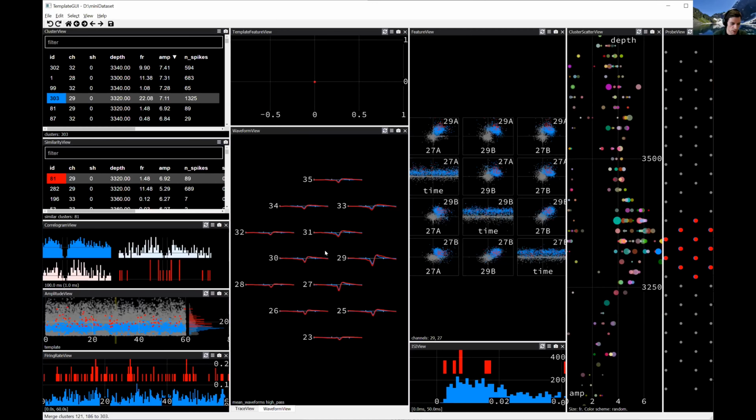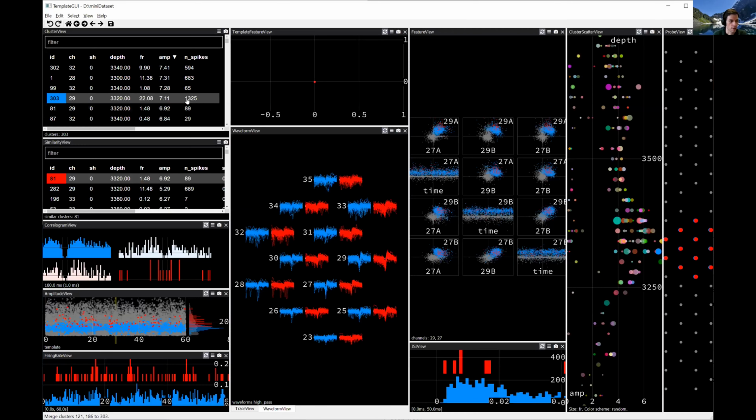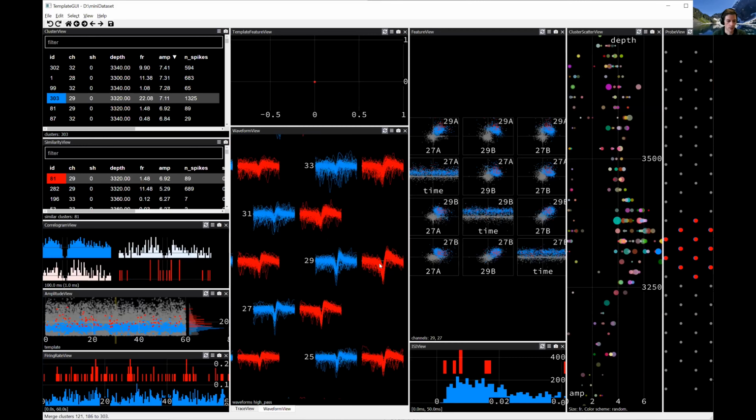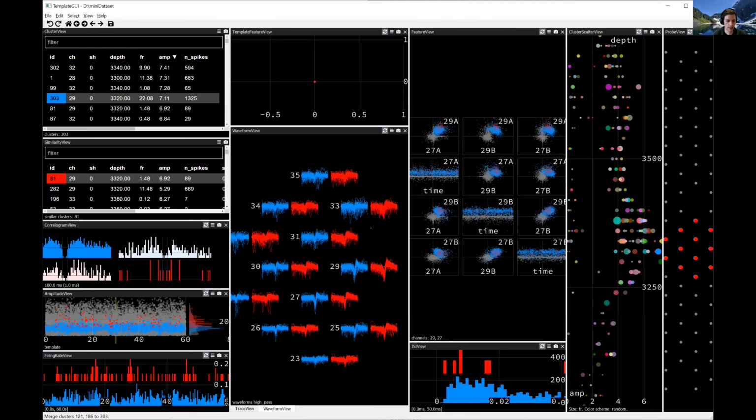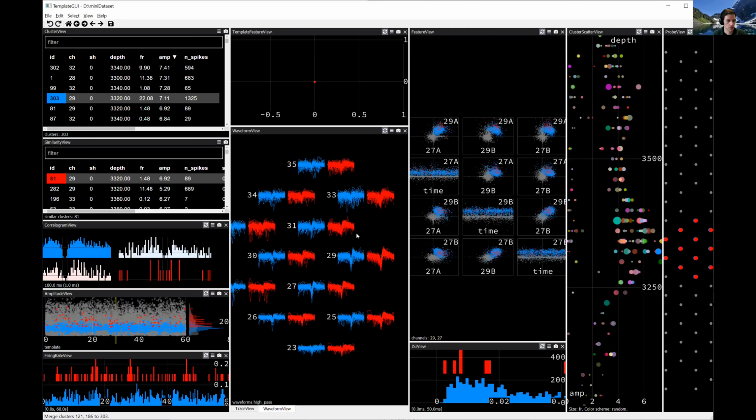So in this particular situation, the thing that I would consider is that our main unit has 1,300 spikes, and this unit we're considering to merge is only 89 spikes. And so whether we merge this unit or not, the total spikes that we're working with is going to change by less than 10%. And so maybe we will err on the side of caution here and just throw away these spikes as being multi-unit activity because of this refractory period evidence, knowing that we're not giving away a large percentage of neurons, even if we're getting that wrong. So let's go ahead and call that multi-unit.